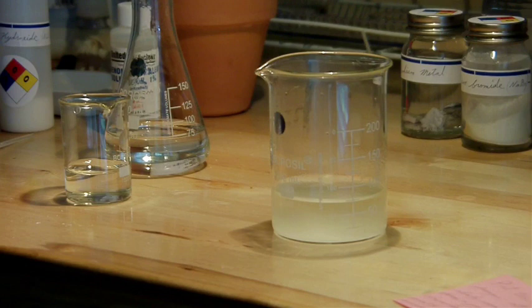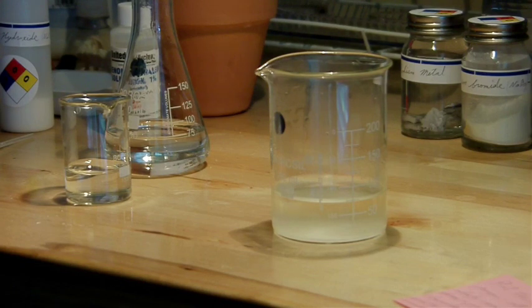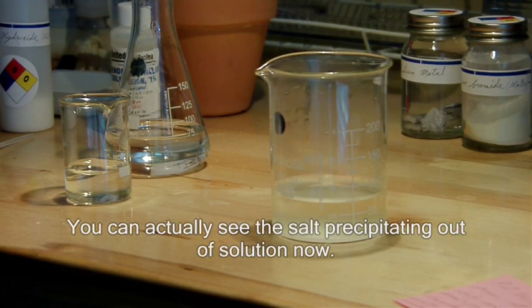So the reaction that's happening here is hydrochloric acid plus sodium hydroxide is going to yield sodium chloride, regular table salt, and water. So if I do this correctly and everything cancels out exactly, I should just end up with a beaker full of salt water.